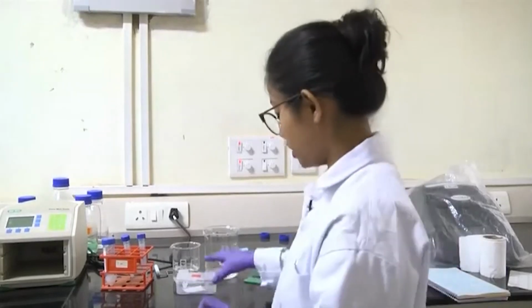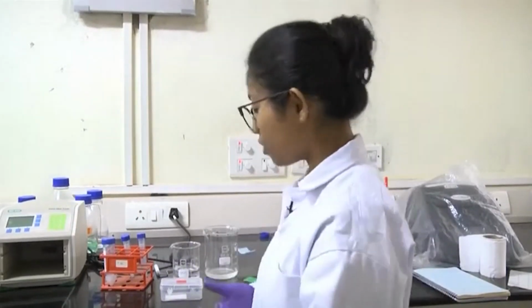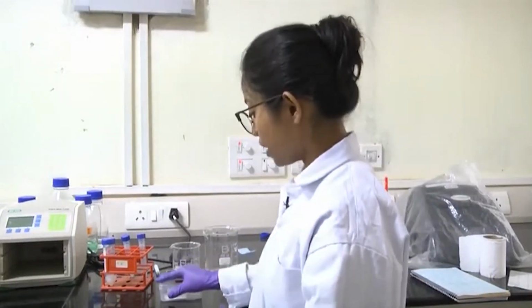From 1 hour to overnight you can keep it in the primary antibody. Depending on how much time you have, and the concentration and efficiency of your primary antibody, you have to optimize the time in which the membrane will be in the primary antibody.